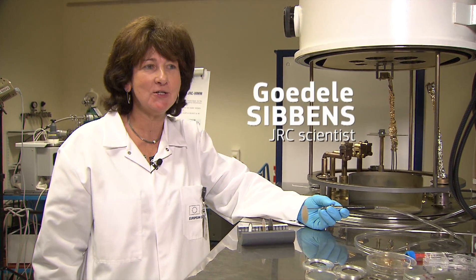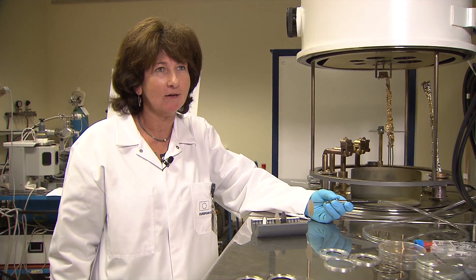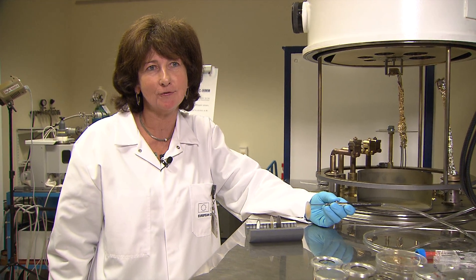I just finished with the preparation of a thin gold layer on a metal disc. These are what we call targets. They are used for experiments at the Gelina and the Van de Graaf to measure nuclear data. They need to be homogeneous because these are high-precision measurements.